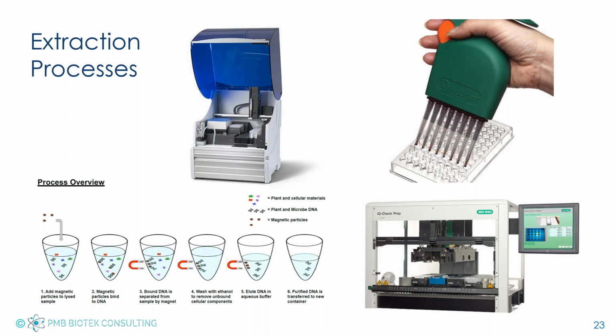So this device is pretty slick, and it's been highly adopted by the meat industry to target STEC from non-pathogenic E. coli. E. coli is present in a lot of meat, so they can eliminate a lot of that general E. coli by using the PIC pen process. And it's the same thought process we're looking at when we talk about flour and all of that contamination that's in there. If you're looking for Aspergillus, you can get rid of the other mold species in there and just keep your targeted organisms present using these IMS procedures. And IMS stands for immunomagnetic separation.